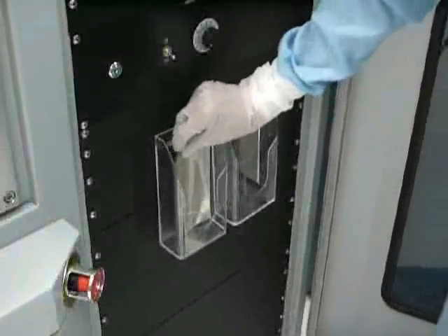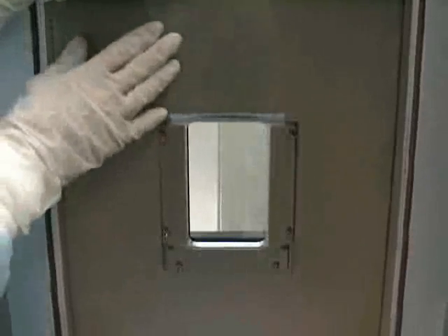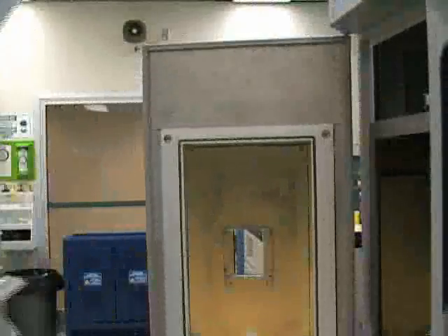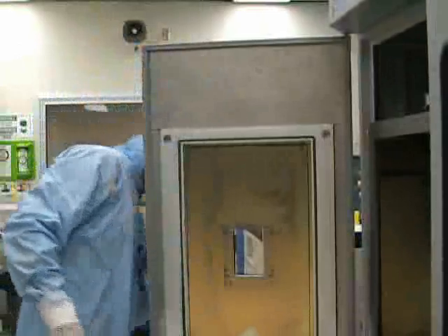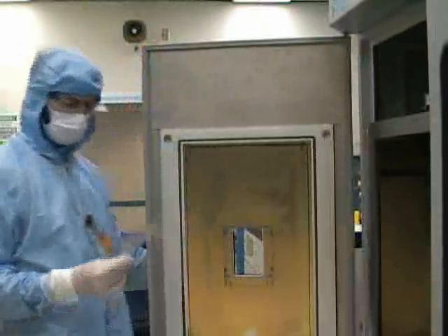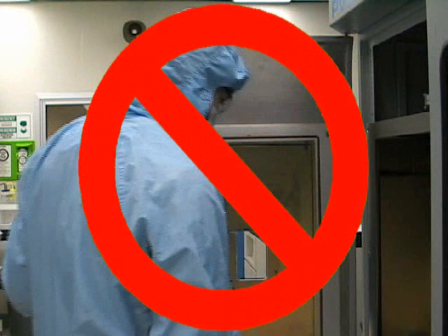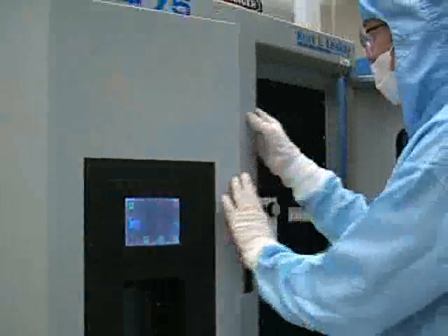Before you begin to pump the system down, you should place a new, clean Mylar film in the holder over the viewing window on the inside of the chamber door. The Mylar films are located on the front of the system. Do not run a process on the PVD without using a Mylar film — the Mylar film protects the viewing window from being coated with evaporated metal, and the viewing window will be unusable if it is coated. When you are ready to pump the system down, close the chamber door and press pump down on the front panel touchscreen.